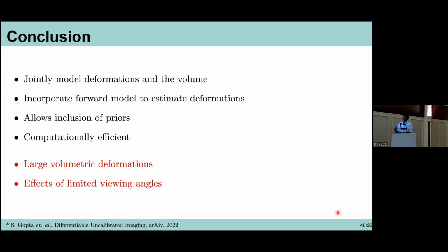The reconstruction, when you use the traditional implicit representation, is much slower compared to our architecture. I think the speed we get comes through the architecture rather than the way we sample the volume itself. It's still in the continuous domain, but we just need to discretize the integral of the projection, and this we still do.